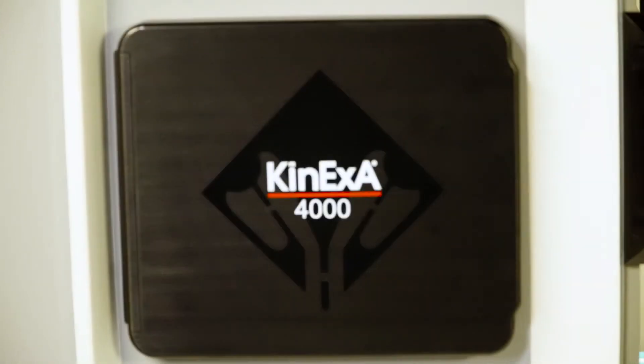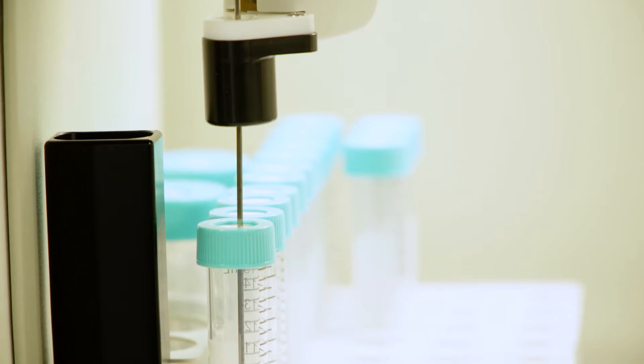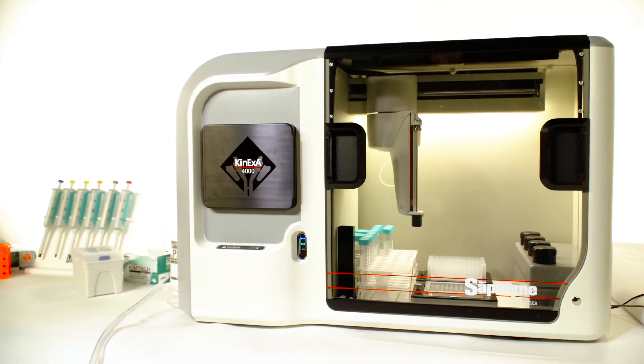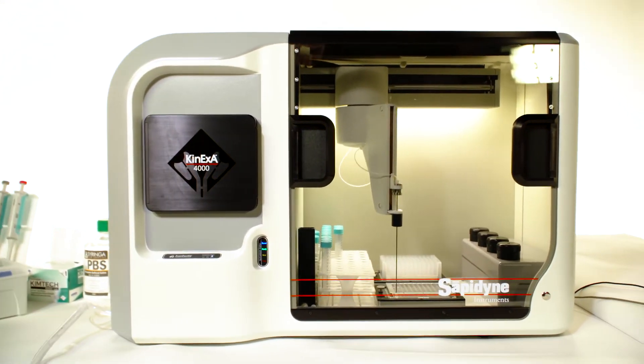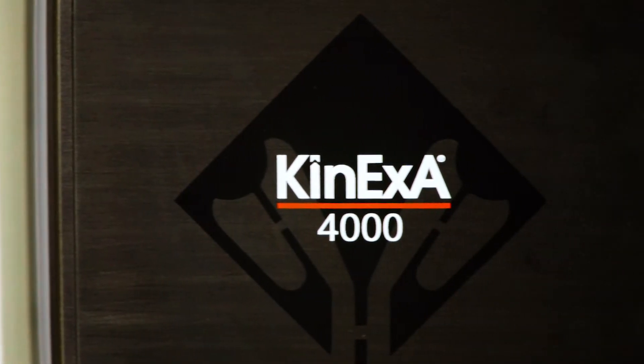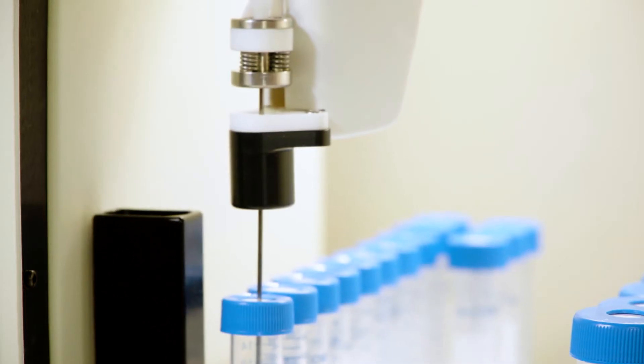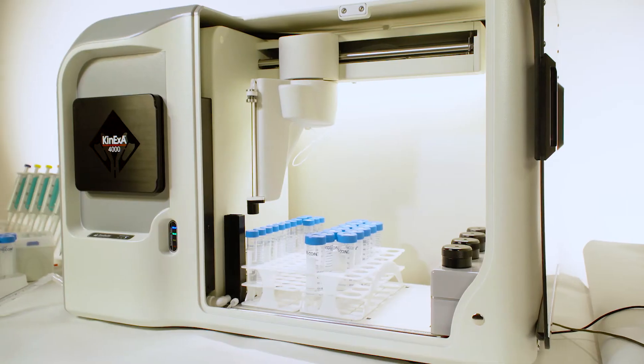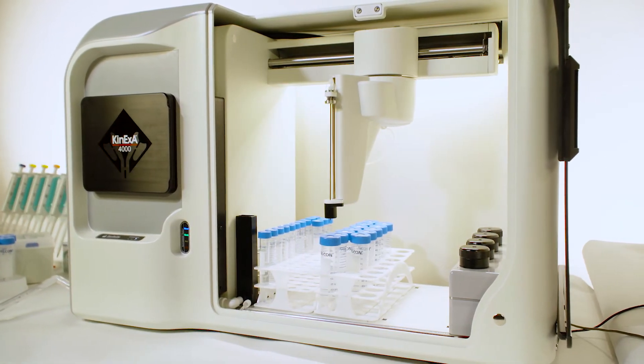The method for determining true equilibrium binding affinities in solution starts with a simple titration. One of the binding partners is kept constant while the other partner is titrated across a series of samples. Next, the samples are left to equilibrate.